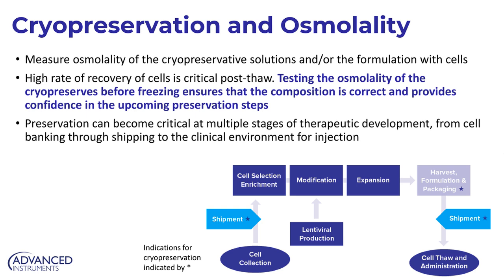So the implications for osmolality testing of the cryopreservative solutions themselves, as well as for the formulations, are critical to maintaining the cell quality and maintaining those critical quality attributes.